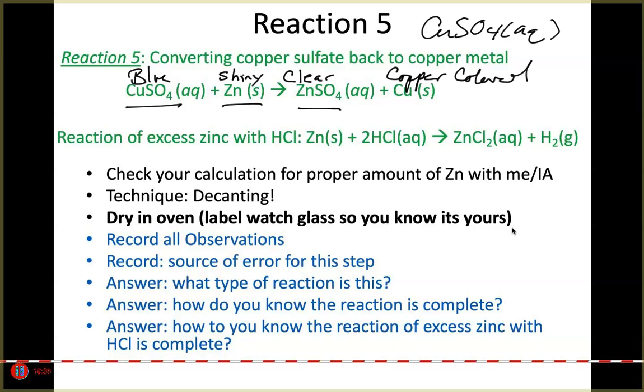So this is going to help us answer, how do we know it's done, right? So again, we've got to make sure we're doing all our observations and recording any sources of error. I know you haven't done it, but you need to think by looking at the procedure, what could have gone wrong? Was it designed to be as successful as possible? So again, I'm going to leave this up to you. I will eventually send out an answer key. I know I keep saying that. I will leave it up to you. Eventually, there will be an answer key.